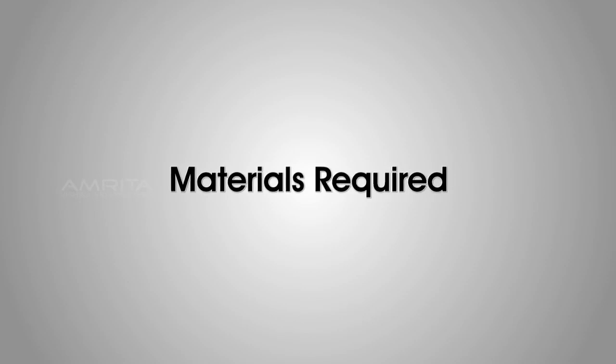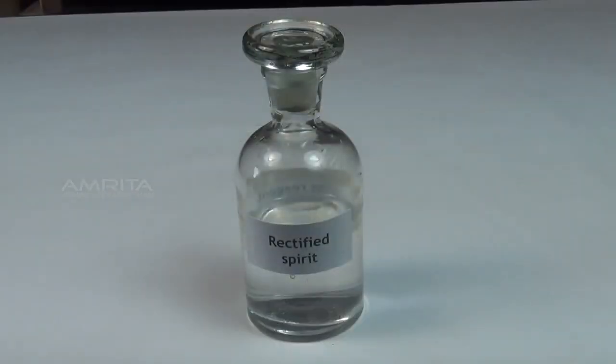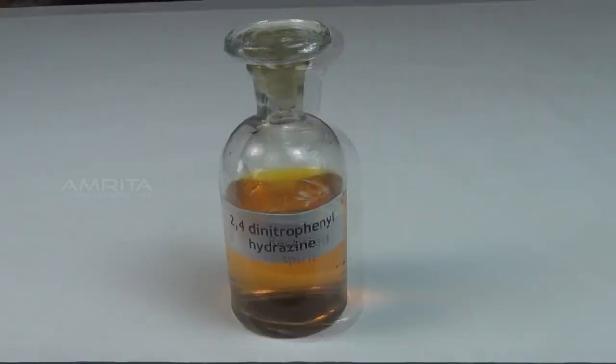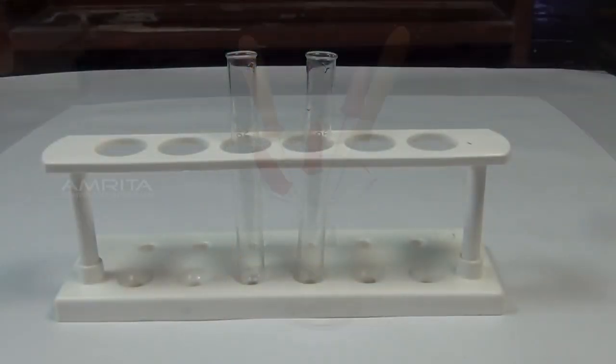2,4-dinitrophenyl hydrazine test. Materials required: organic compound, rectified spirit, 2,4-dinitrophenyl hydrazine solution, test tube and droppers.